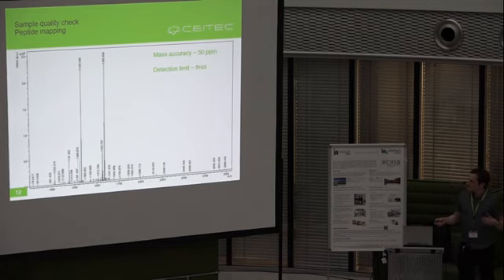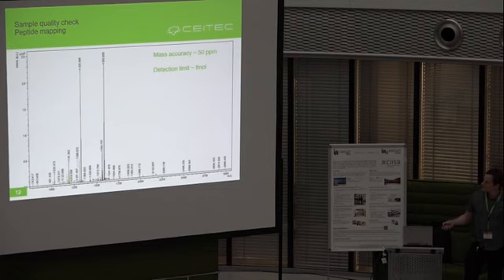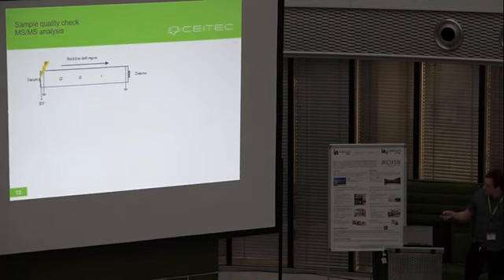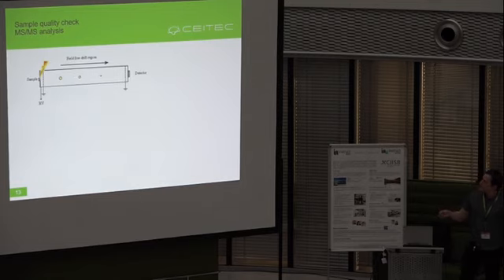We must go on and carry out fragmentation of individual peptides from this peptide mixture obtained by proteolysis of the original protein. For that purpose, we can also use mass spectrometry, also MALDI mass spectrometry, where we, for example, select this ion for fragmentation, and then we apply higher laser power on the sample so that the peptide gets not only ionized, but also its ions are metastable and undergo fragmentation during the flight in the analyzer.